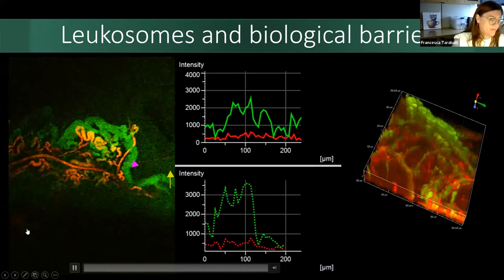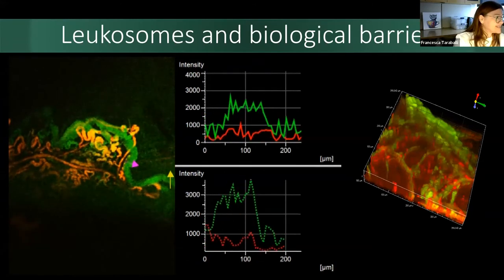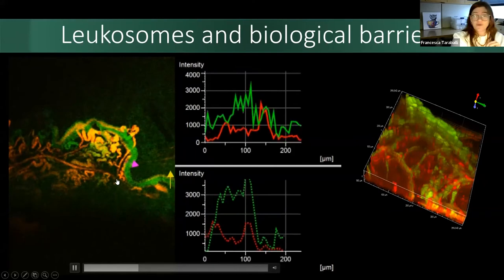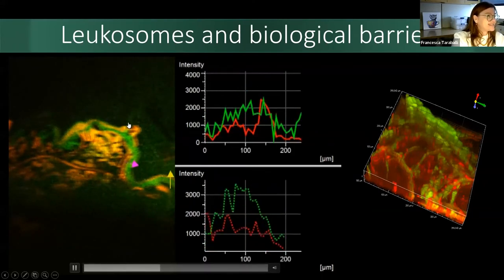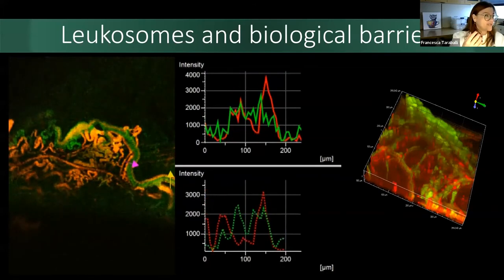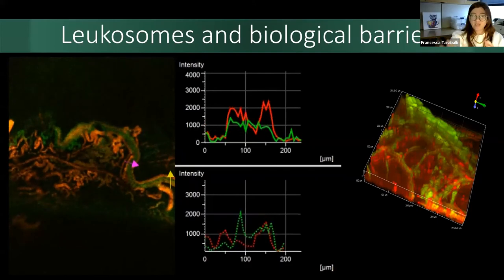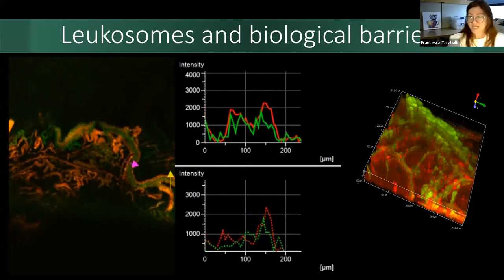You can see exactly here, there is another example. This is a tumor microenvironment. So there are vessels in the tumor. You can see that, again, the green are the vessels and the red are the nanoparticles injected over there. And they stick to some vessels that are particularly inflamed. And then with time, what we can monitor with the intravital microscope is how these particles diffuse in the stroma, which is our overarching achievement, for example, for drugs.